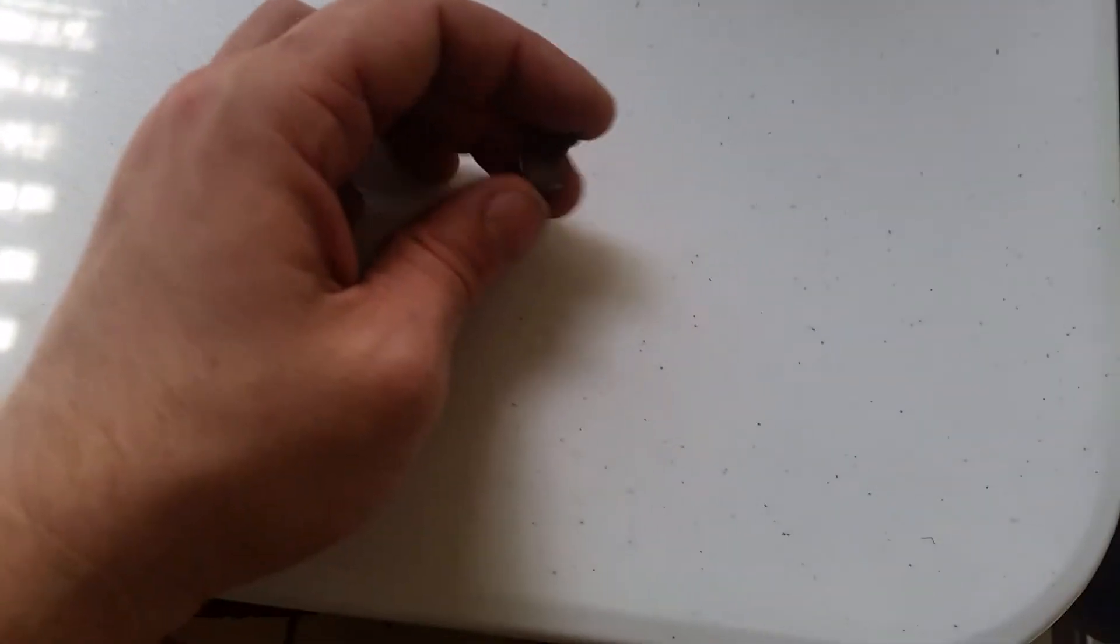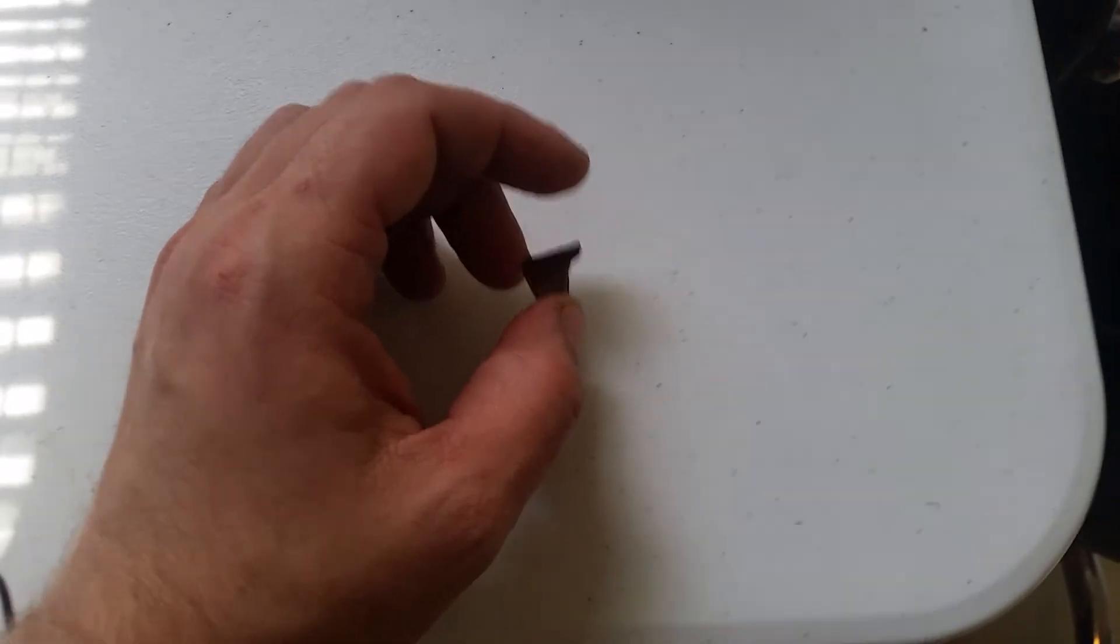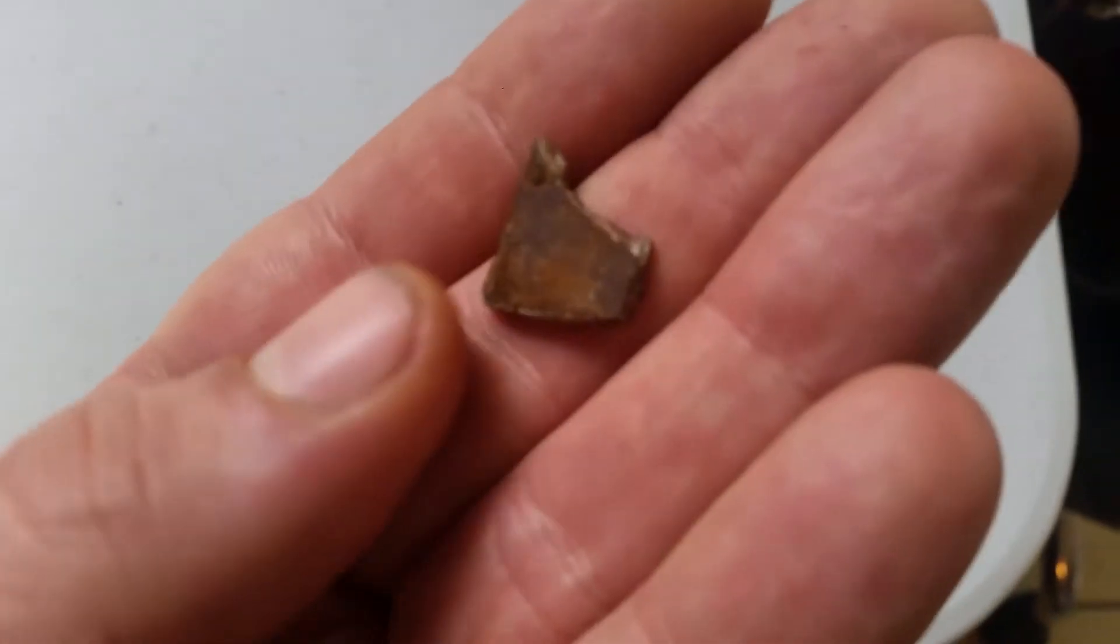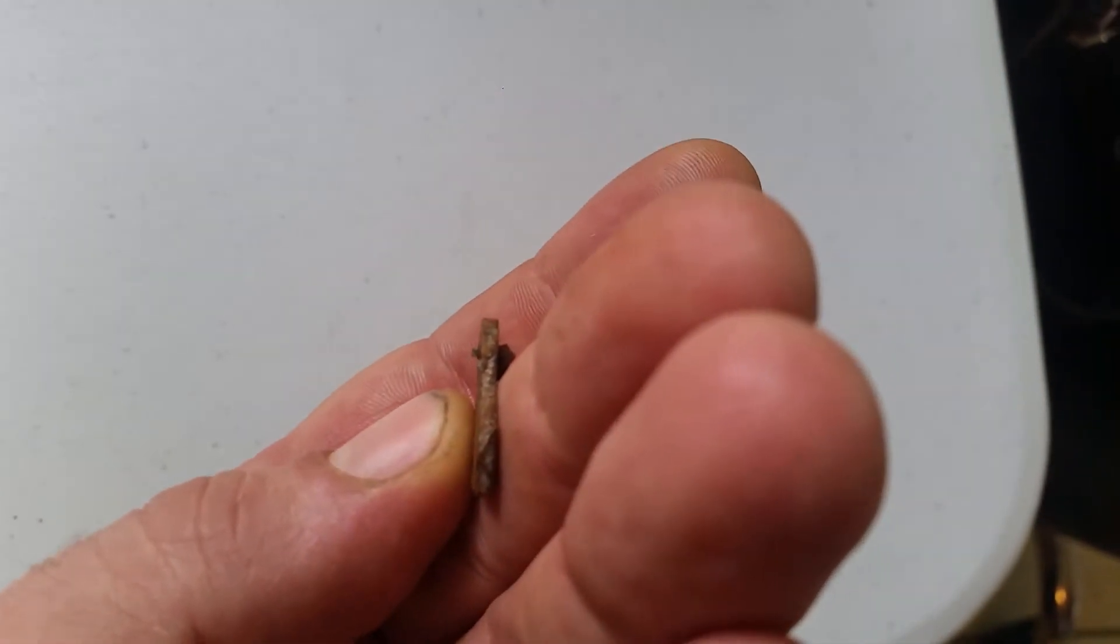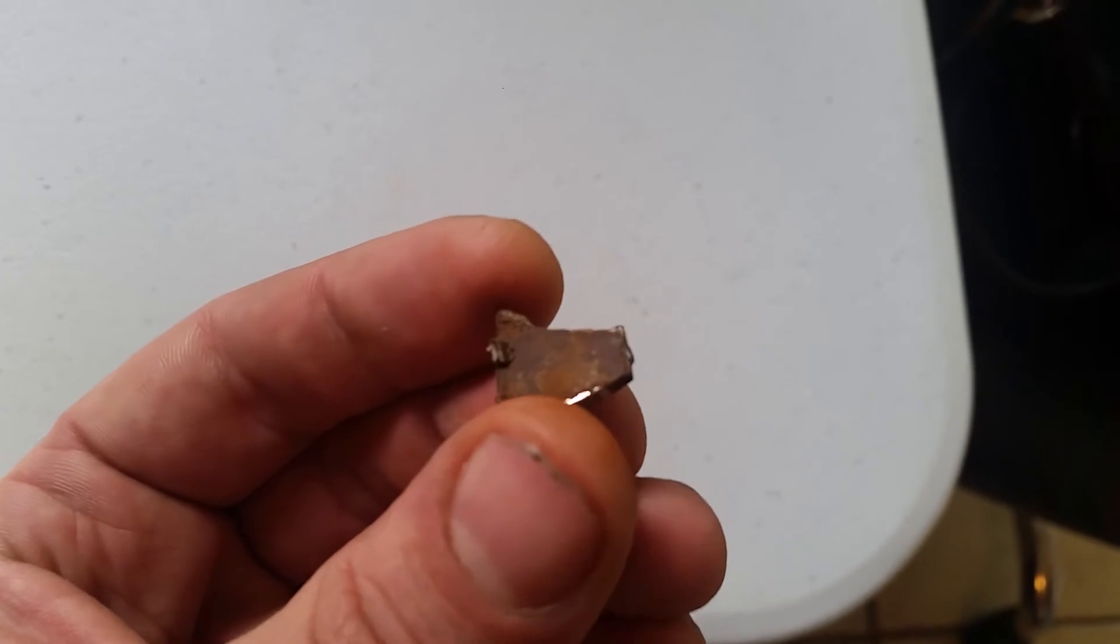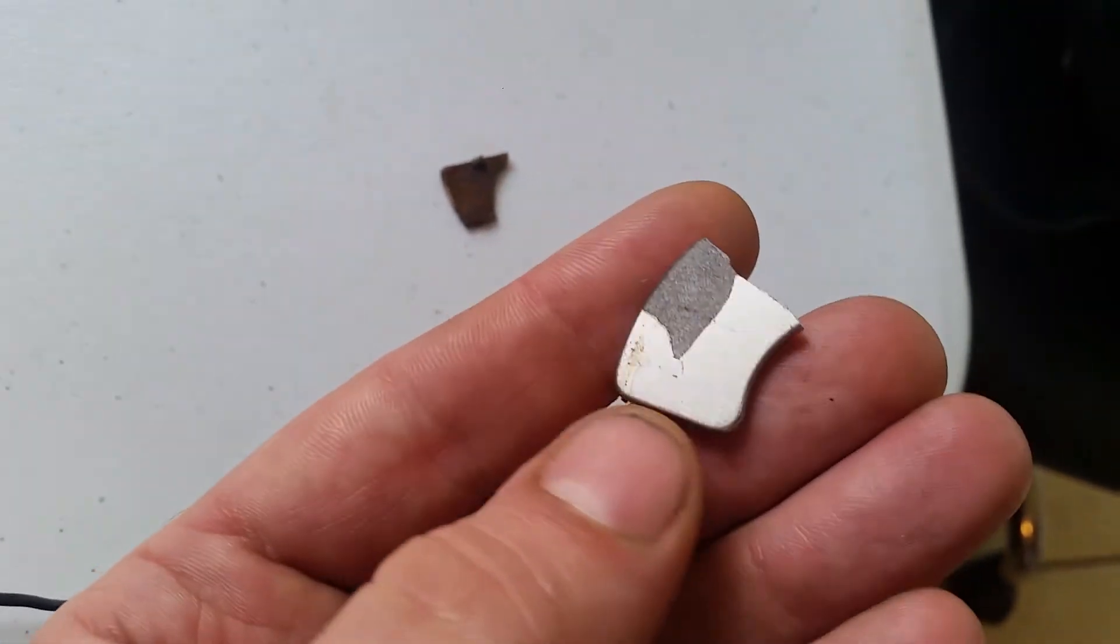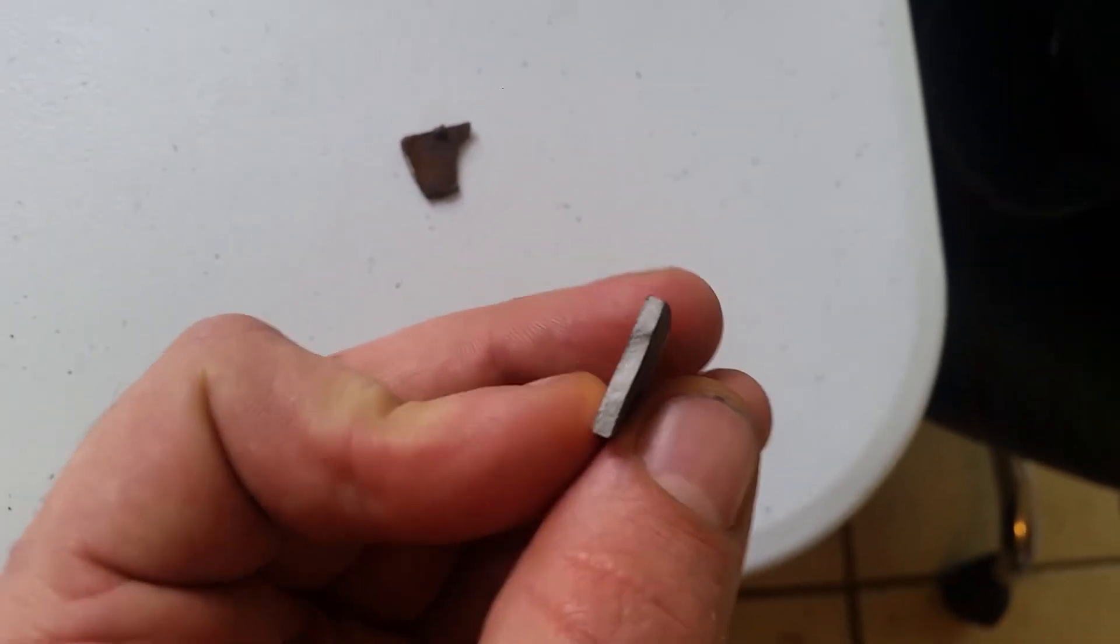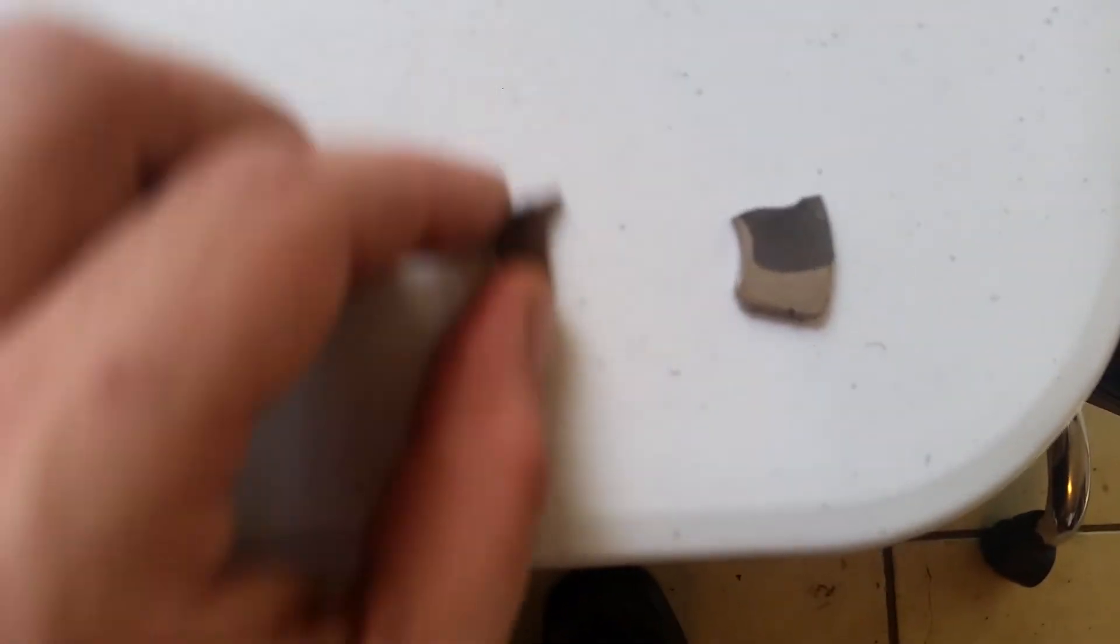Okay, guys. So I took the magnets out of the autoclave on this last run. And it did appear that we started to get a reaction. They're quite magnetic still. But you could definitely see some corrosion, or there's some sort of reaction. So that's what a piece looks like coming out. There's still a piece stuck on it. Like I said, it's quite magnetic still. So obviously, it didn't react all the way through. But you could definitely tell something happened. For instance, here's a magnet before it goes in. I just broke it apart. See, it's a nice silvery inside and a darker gray outside. I'm gonna compare the two. Come on. There it goes.